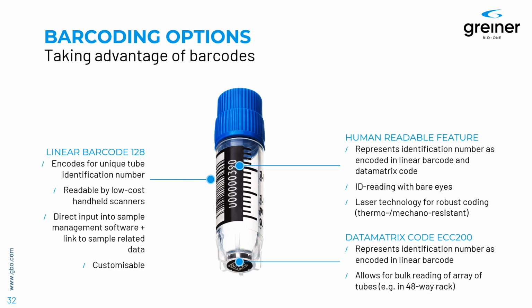The identifier is represented in three different forms. One time as a human readable feature. You can just read it with your bare eye. You don't need any barcode scanners. And this is good whenever you need to identify a sample and maybe cross-check it versus some shipping documentation. On both the tube and the documentation, there appears the same identifier, and then you can just read all the sample-related information in the documentation.